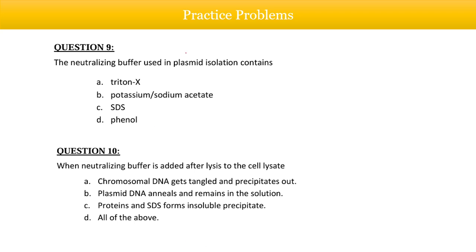Now, during plasmid isolation, we use a neutralization buffer. What is the composition of this neutralization buffer?